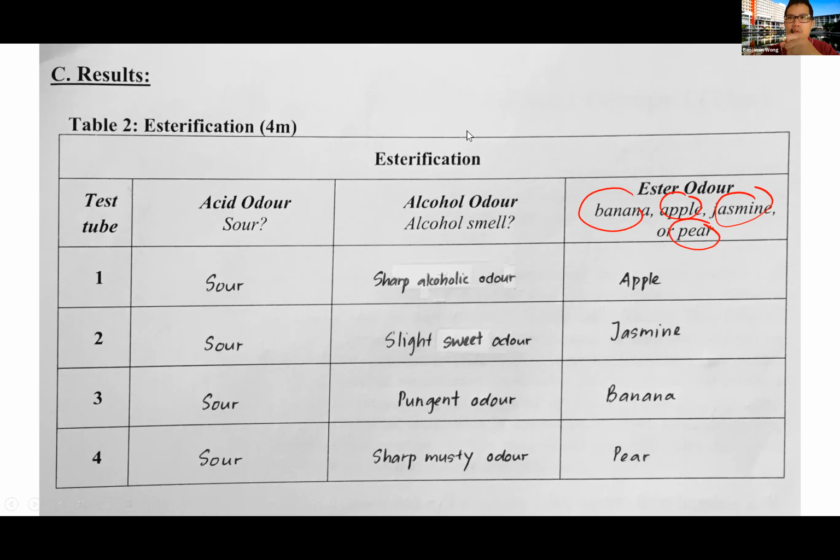So how you should smell is that you have that ready, then you just use your finger to push the vapor to your nose. After you push, if it's still very weak, then only you smell directly. So always do this first. Never smell directly, in case it's a strong acid. Some people smell the acid directly and it destroys all your nerves.